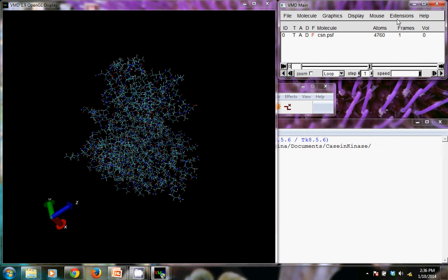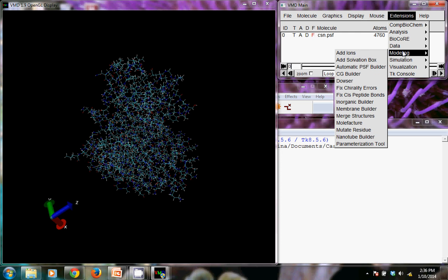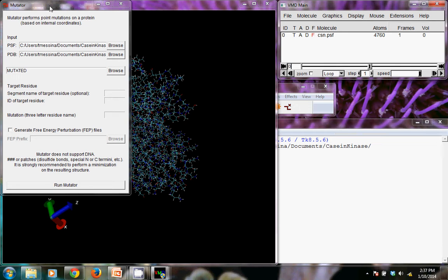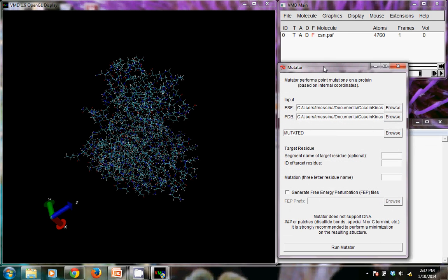So now to make the mutation, we want to go to extensions, modeling, mutate residue. That will open the graphical user interface for that.